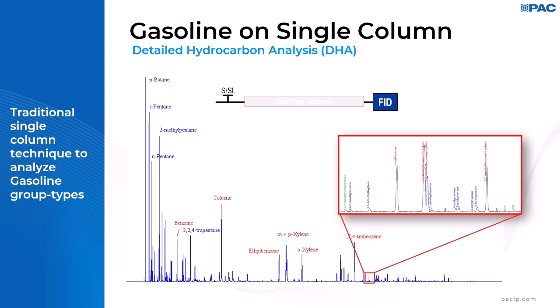Enhanced detector linearity will allow accurate quantification of components present in high concentration while preventing disappearance of low-level components in the noise of the detector. And third, there is an additional advantage for group type separations. Due to the grouping of components in the chromatographic process, detectability of components is much improved. This will result in a more accurate determination of the hydrocarbon group types present in the sample.